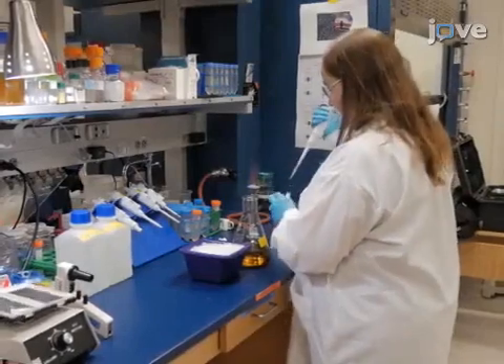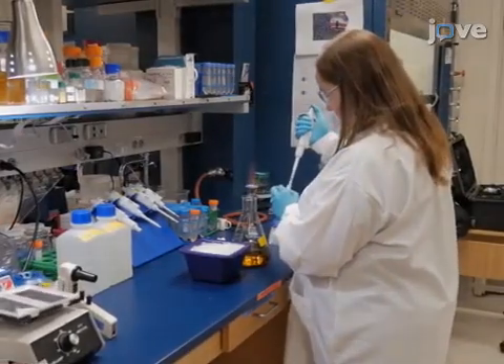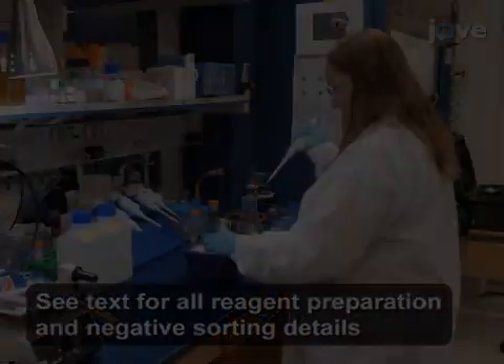For positive sorting of the bacterial display library, first inoculate 500 milliliters of LB broth.